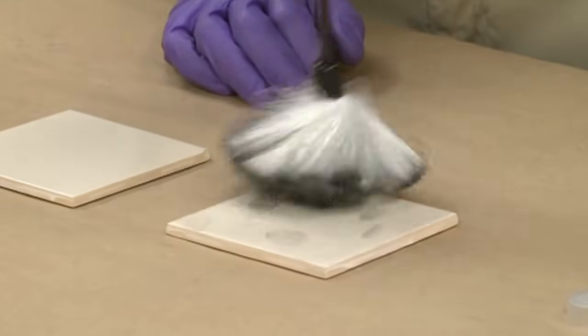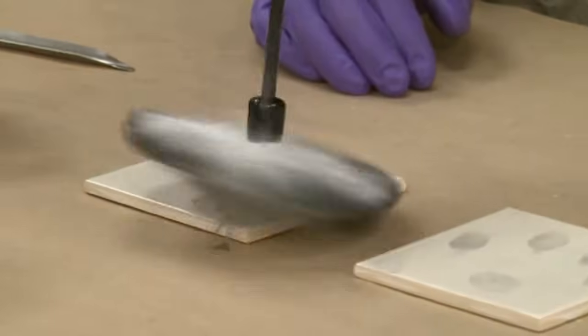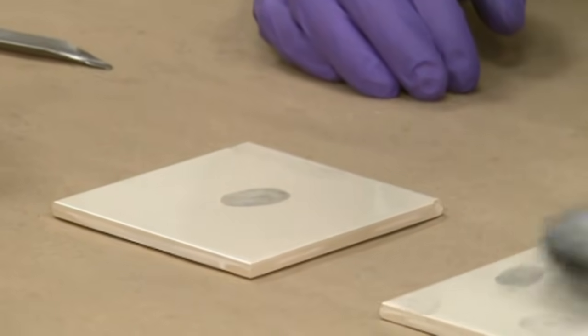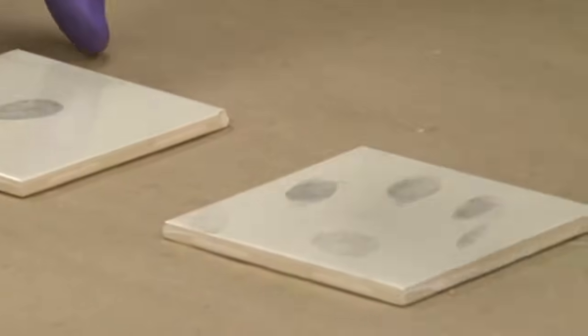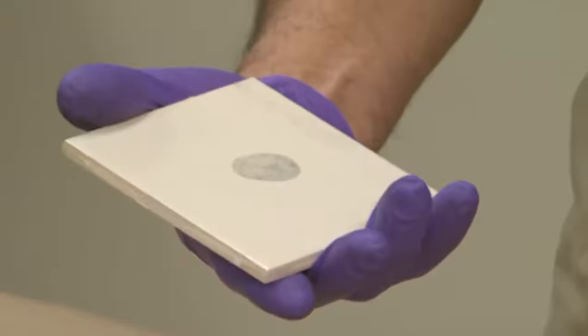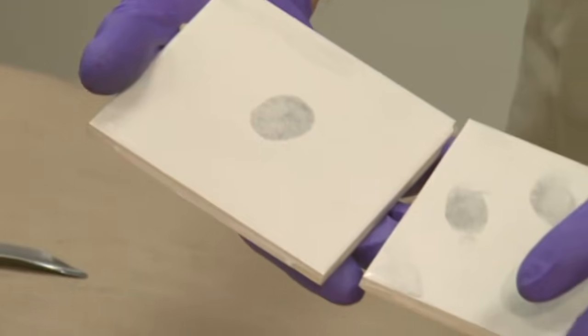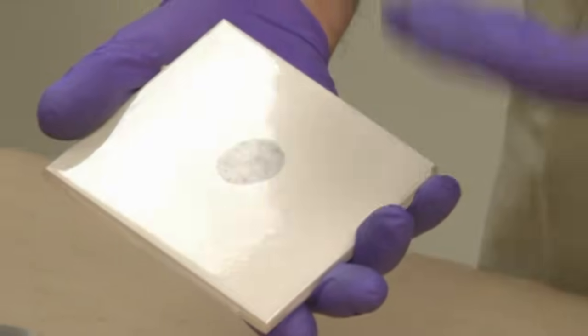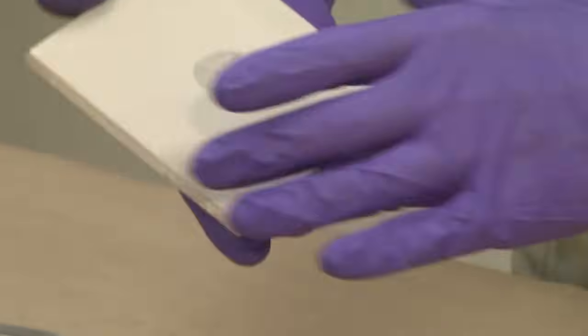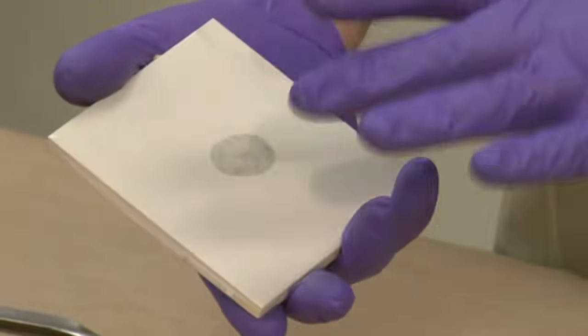What we have now is the development of some latent prints. Latent prints mean they were invisible initially, and after processing we now have development of these prints. We don't want an excessive amount of powder on there. We now have a nice black print on this smooth surface. This is reacting to the sebaceous material in the print, and you can notice there is no excess powder on the areas that were not touched, giving us very good information for an examiner to use.